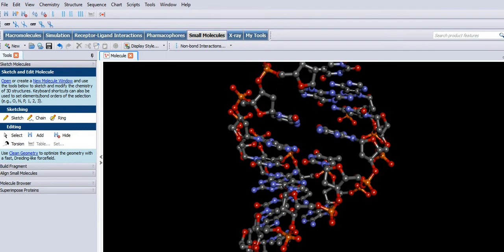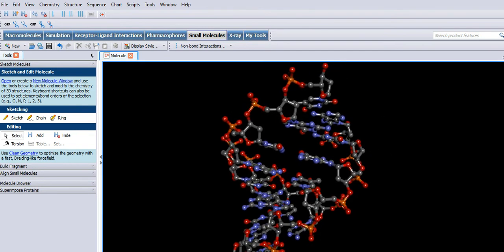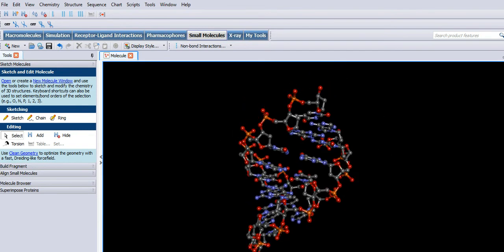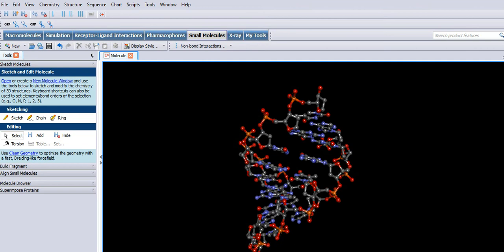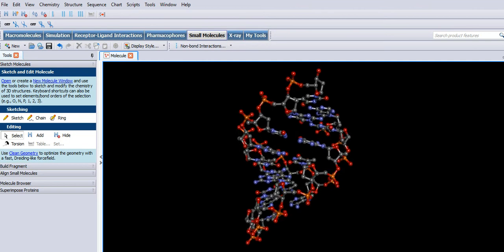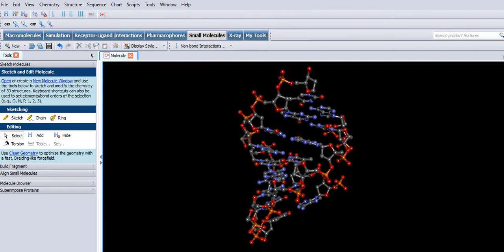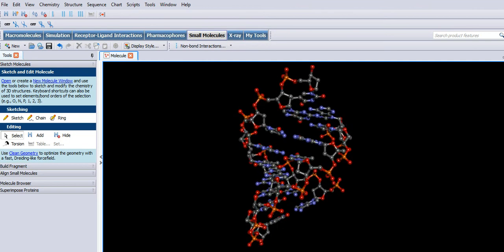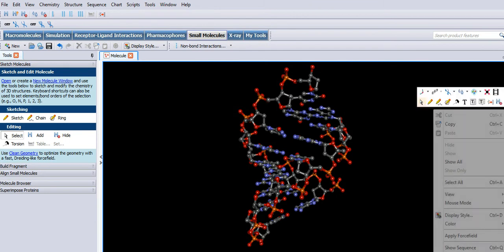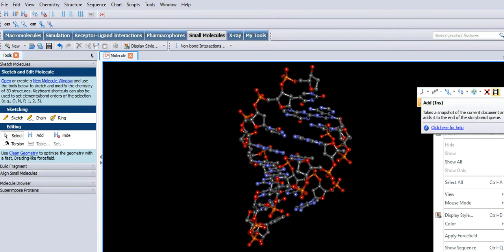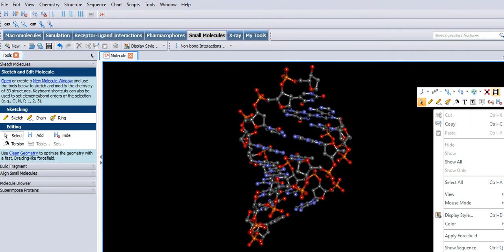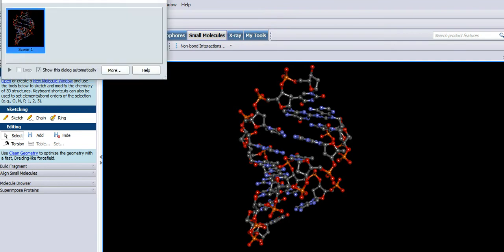If you're really flash, might lose marks for this. Right-click on the screen. Top right, there's a little film strip there. You can see that, okay? It takes a screenshot. It's showing top left now.